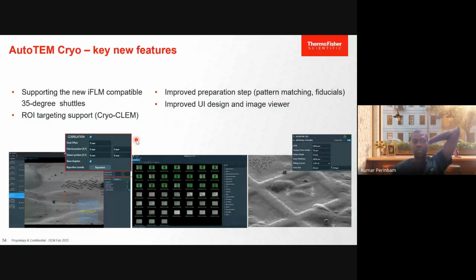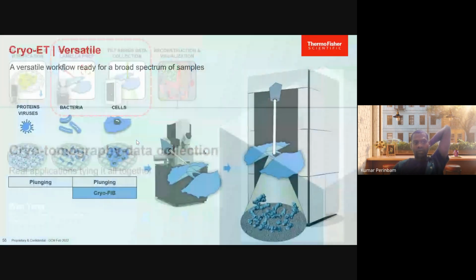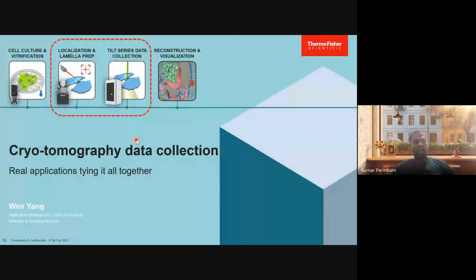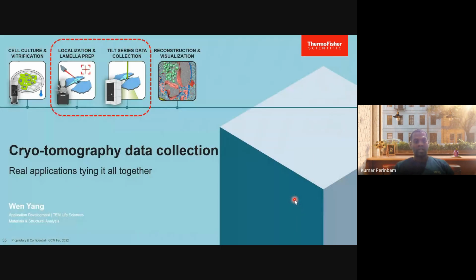These are all completely automated. The software helps you identify good regions automatically. The moment you give the automatic patterns, it will identify good regions, then fluorescent regions, and around that region it creates a mask, and then cuts off the sample and creates thin films which you can use for imaging.